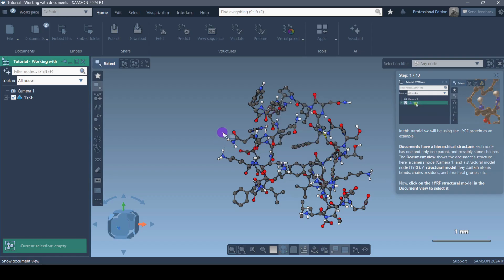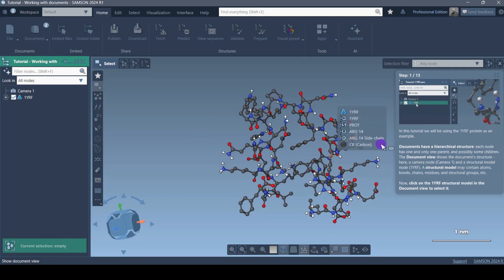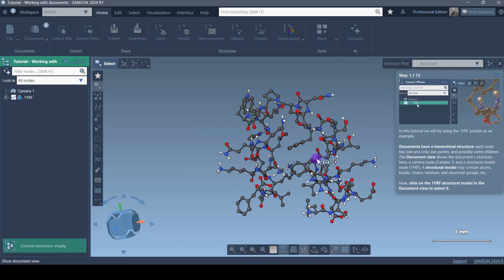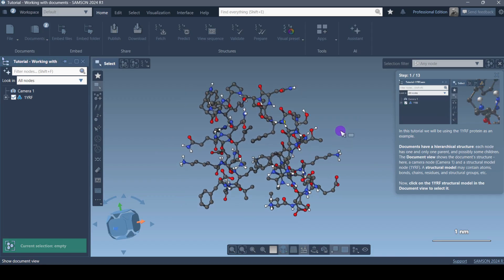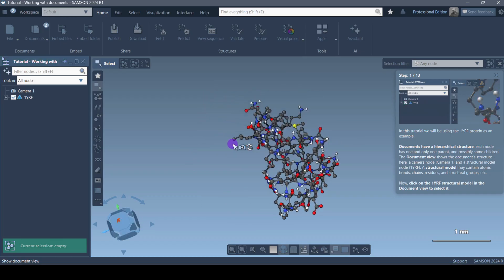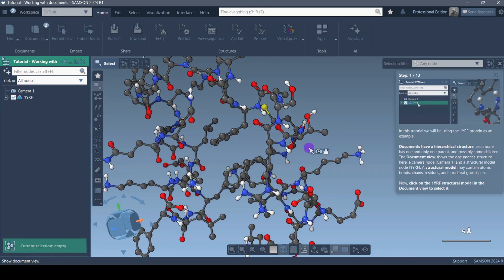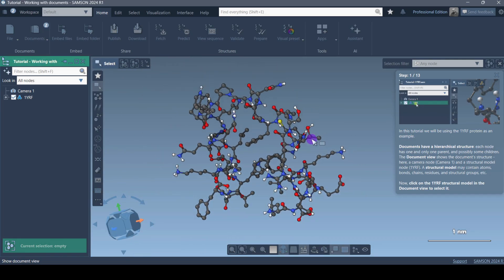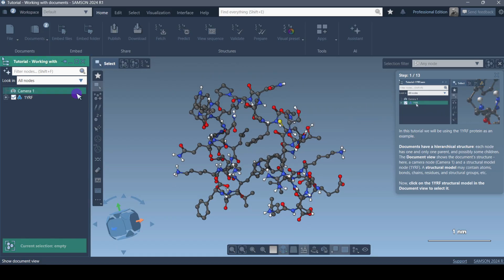If you're new and haven't watched my previous video, please watch that because I've shown you how to use all the commands related to moving the structure — how you can use the mouse in SAMSON to zoom in and zoom out. That is very very important and is going to be really helpful to see the structure. It's not that difficult.